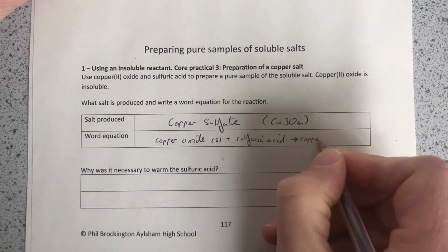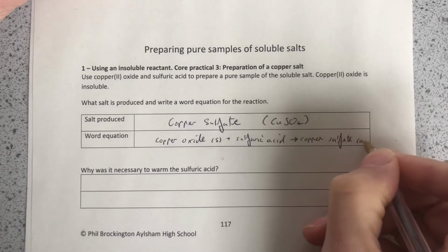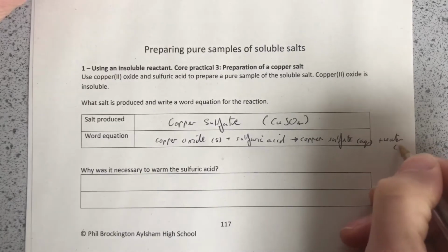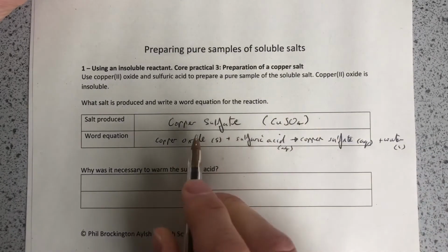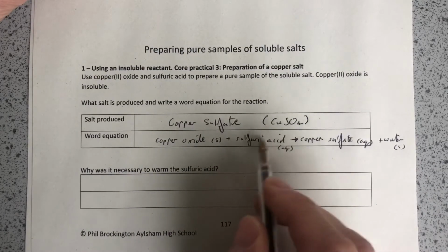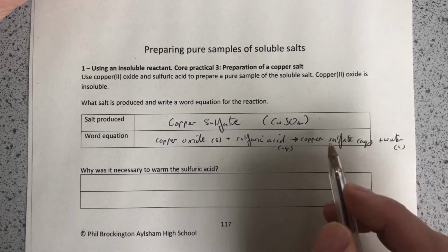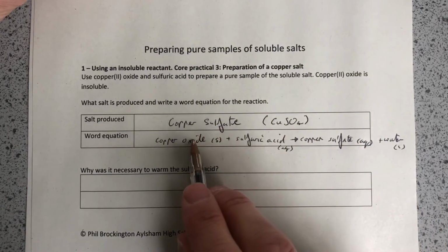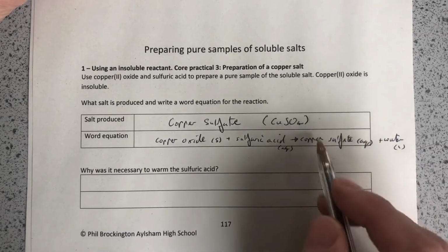It also produces water. Copper sulfate is soluble, so that will be aqueous, and water, which is of course pure, is a liquid. Sulfuric acid is also aqueous. So we have an insoluble reactant reacting with sulfuric acid, which is a solution, to make copper sulfate solution and water. Now we want to prepare pure copper sulfate crystals, no sulfuric acid, no copper oxide and no water, just copper sulfate. That's the aim.